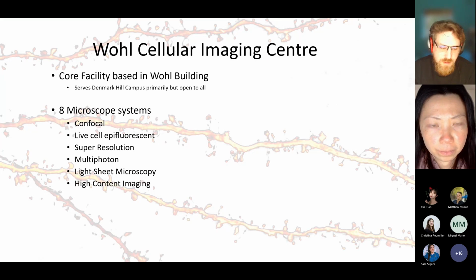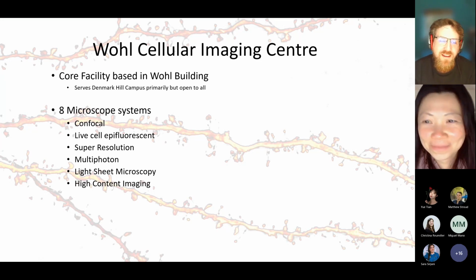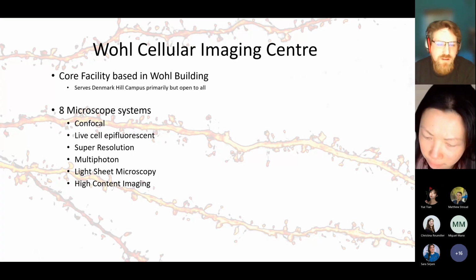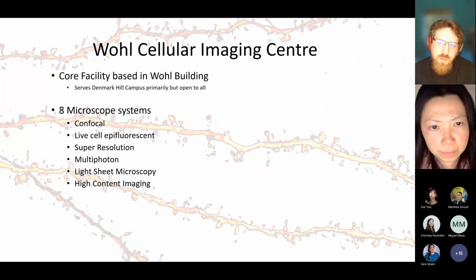So I believe they're developed in llamas. I don't know why llamas, but llamas have tiny antibodies apparently. And they're quite small. There are other ways to tag your proteins, so you can use small N-terminal tags which will bind fluorophores. So actually your nascent protein might then just be fluorescing with the presence of the dye that you use to make them work. But there are quite a few strategies towards the sort of staining for super resolution imaging.